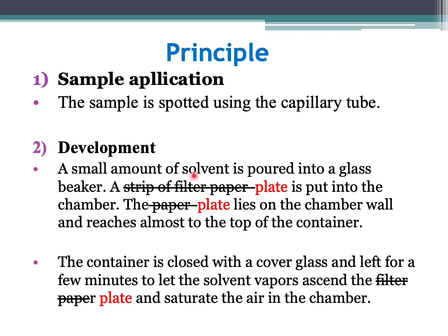Development. A small amount of solvent is poured into a glass beaker. A strip of filter paper is put into the chamber. The paper lies on the chamber wall and reaches almost to the top of the container. Dia bukan filter paper yang kita guna, yang kita guna adalah kita punya stationary phase, the plate, coated dengan stationary phase, glass atau plate yang coated dengan adsorbent. So dia adalah TLC, kita menggunakan glass ataupun plastik yang coated dengan adsorbent.